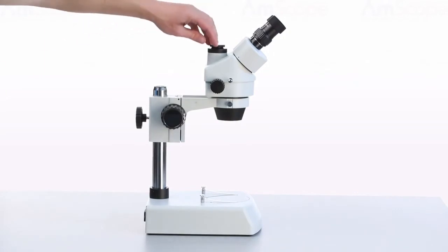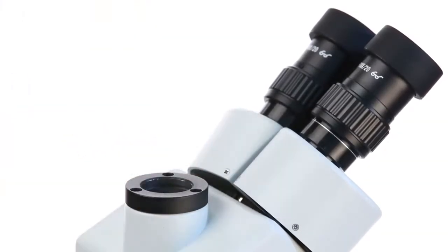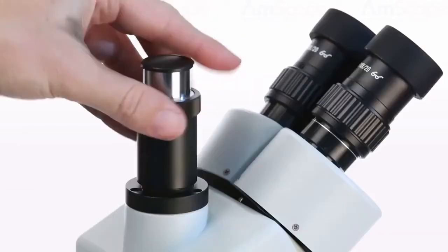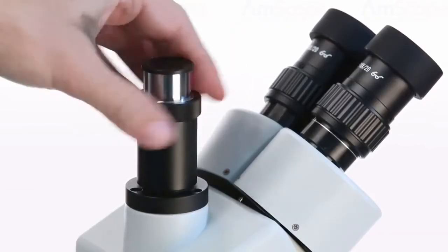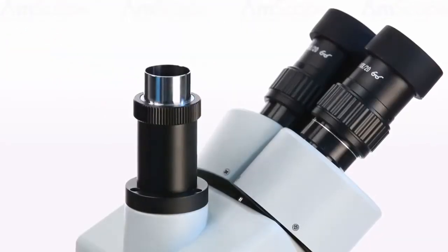Now we'll attach the trinocular viewing port. Start by unscrewing the viewing port's dust cap. Then screw the trinocular port into the threaded opening. To attach a camera, simply remove the port's dust cap.